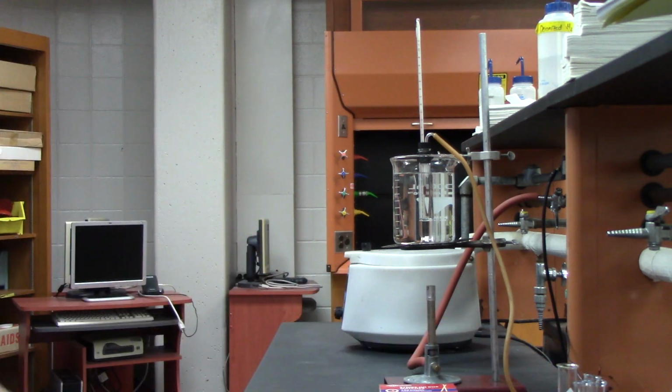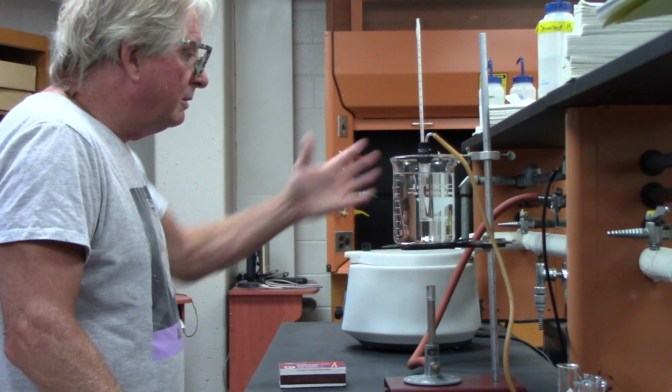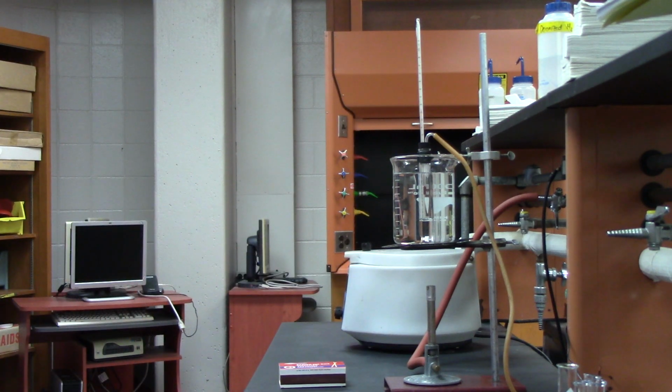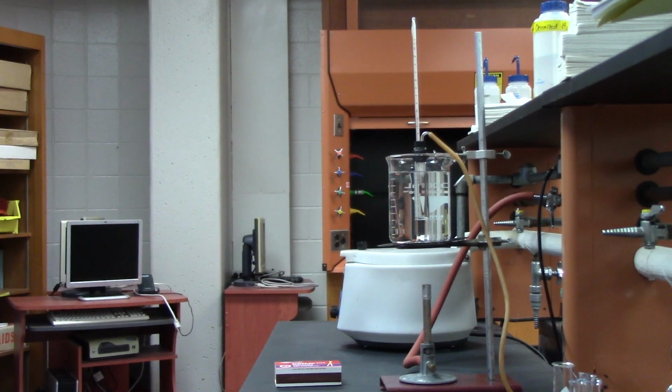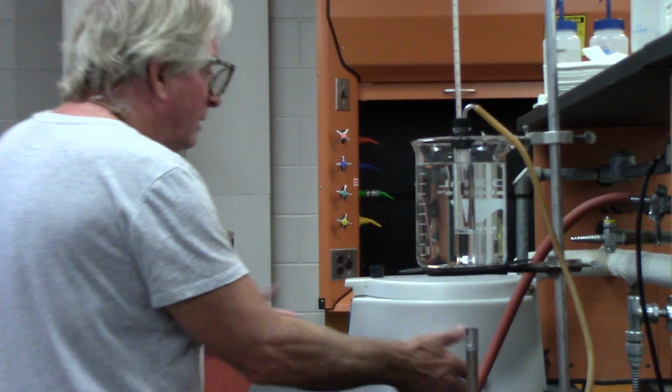So we're done with everything, and I'll take care of that in a little bit. But here is our setup. Okay. And so let's move this because it's kind of in the way.